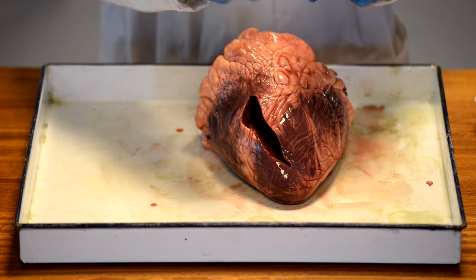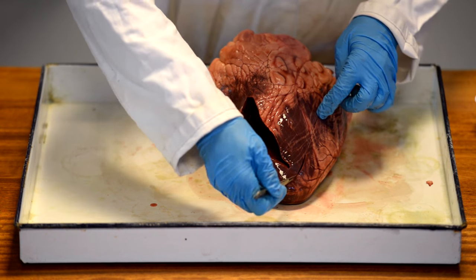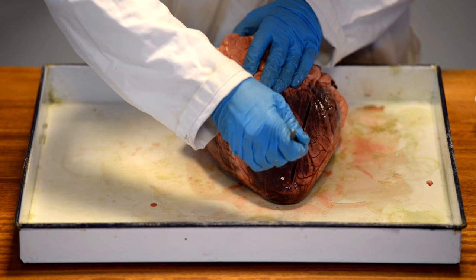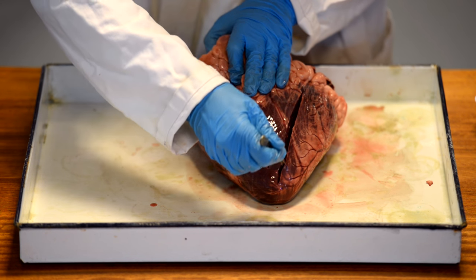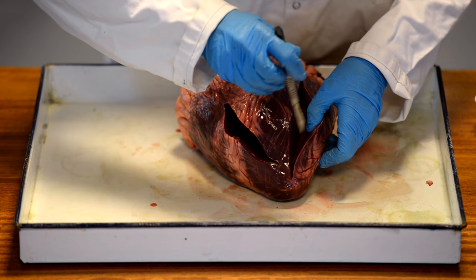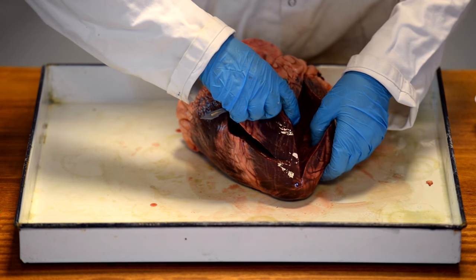When you're using a scalpel, with a nice sharp blade, make a line first so you know where you're going. You're going from the atria, pointing towards the apex of the heart. Use your scalpel almost like brush strokes. Don't hack right in. And what you can probably see as I'm doing this is the massive thickness of muscle that I'm cutting through. Go through more and more muscle, and I'm nearly there. I can feel the next couple of cuts, and I'm going to actually be in to that ventricle.